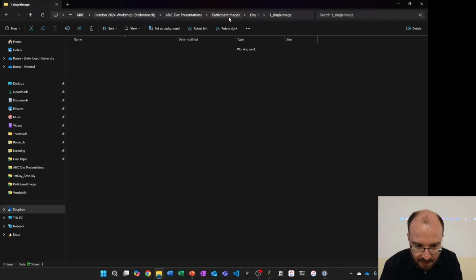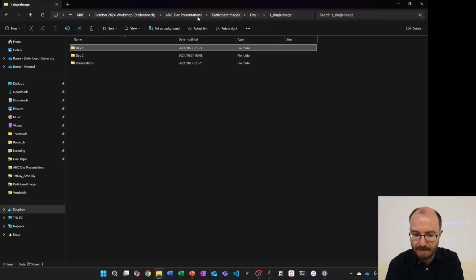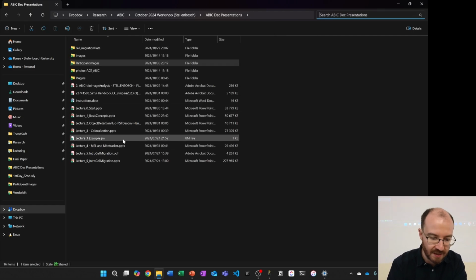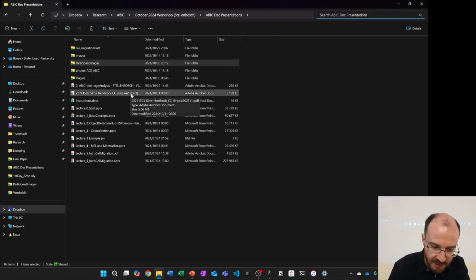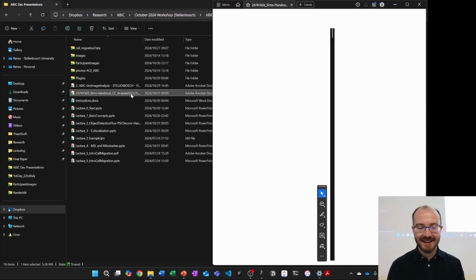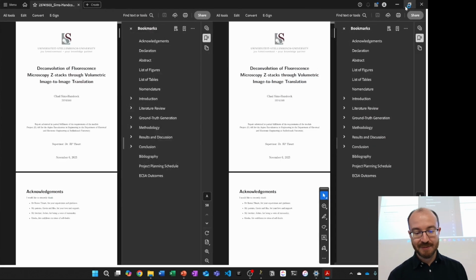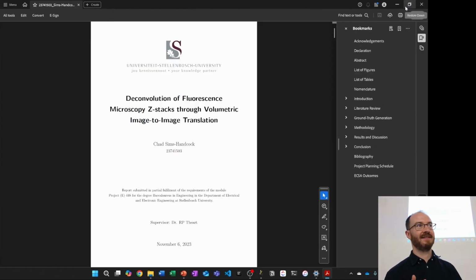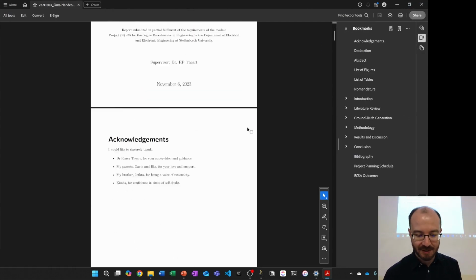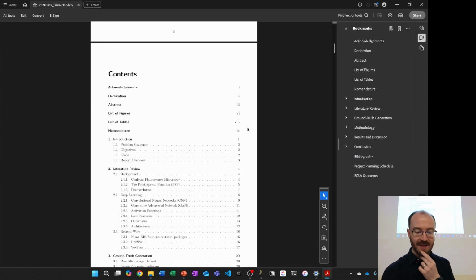So we started this project where we tried to train a neural network that can do the deconvolution for you, because it's so computationally expensive and extremely slow. If you have a lot of data that you need to deconvolve, you literally put it on and you sit for days, waiting while the thing is deconvolving in the background. A neural network is incredibly fast. It's like 1 or 2 seconds and the deconvolution is done for one image. So you definitely want to leverage that speed.